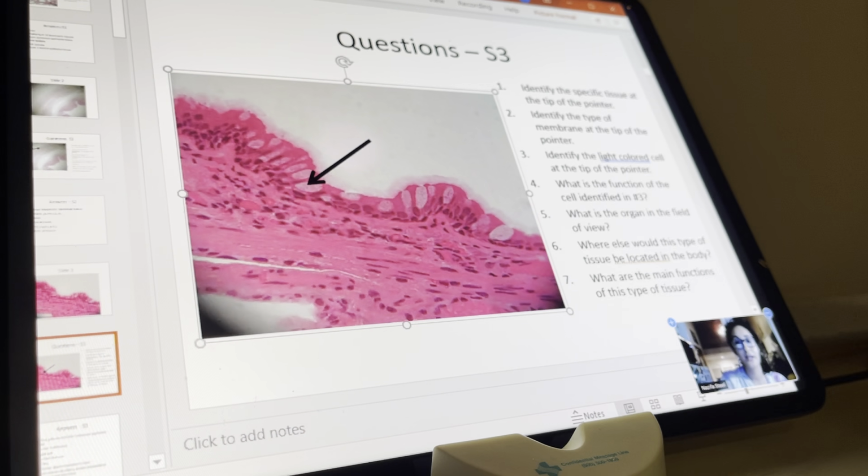Okay, it starts with a G. It starts with a G? Oh, yeah. You drink out of it. That's Eric's. I drink out of it? I mean, you don't, but kings do. Oh, the goblet? Is that what you said? Yeah, you got it. Exactly. Goblet cell.